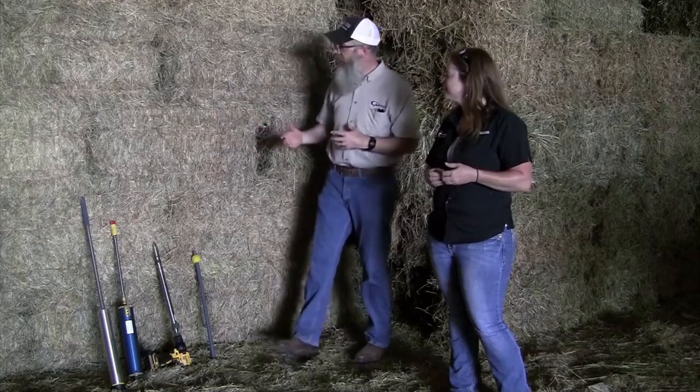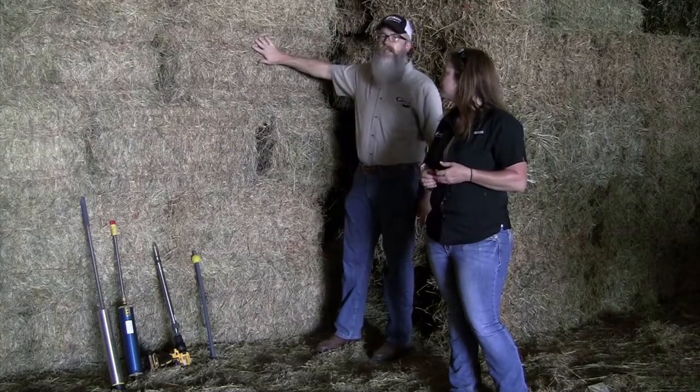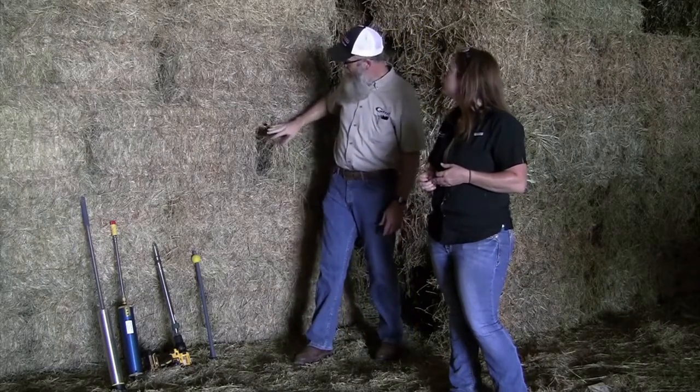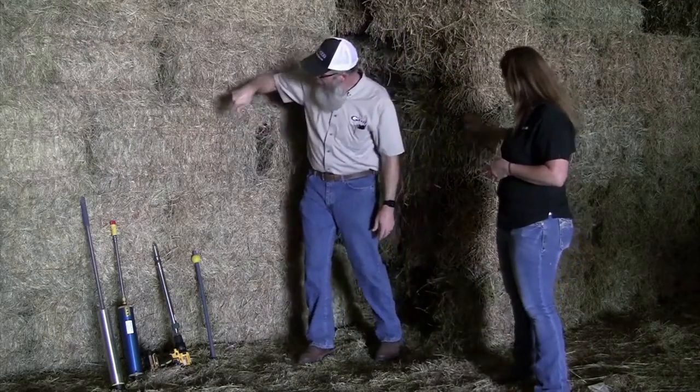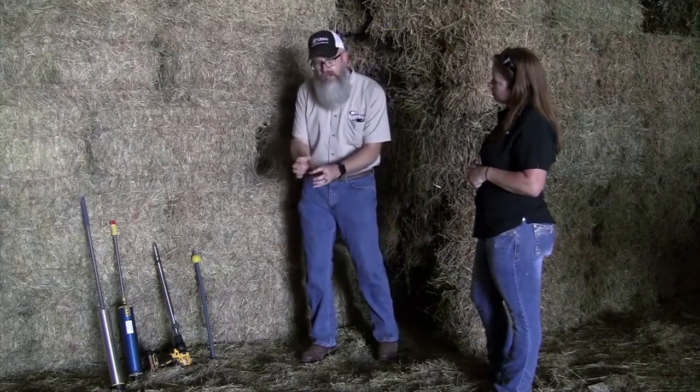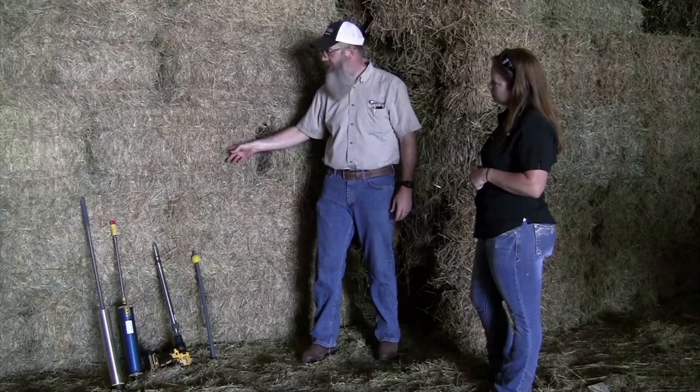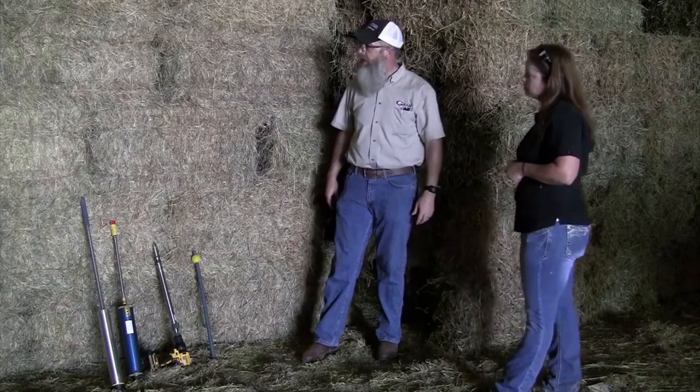That's really critical because what you're trying to do is represent as much of an area as possible. The way that this stack is made, we actually only have a few that are on this end with the short end exposed. If we were to go into the long side here, we're really only covering one tiny spot in the field. And if we stuck that probe in, we would actually miss a lot of the material. So that's crucial: to avoid a situation where you're not getting as much representation with that core as you possibly can.